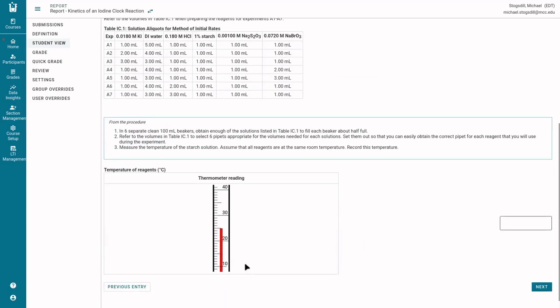some data that they want me to fill in here. The first thing is going to be reading off this thermometer here, which is pretty straightforward. Just keep in mind, this middle guy here is 5 higher than 20 and 5 less than 30, which last I checked was 25, and that you should be giving it an extra digit. Even if you see it as being exactly at 25, that is not 25 there, that is 25.0. I see this as being just under that line, so I'm going to call it 24.9.